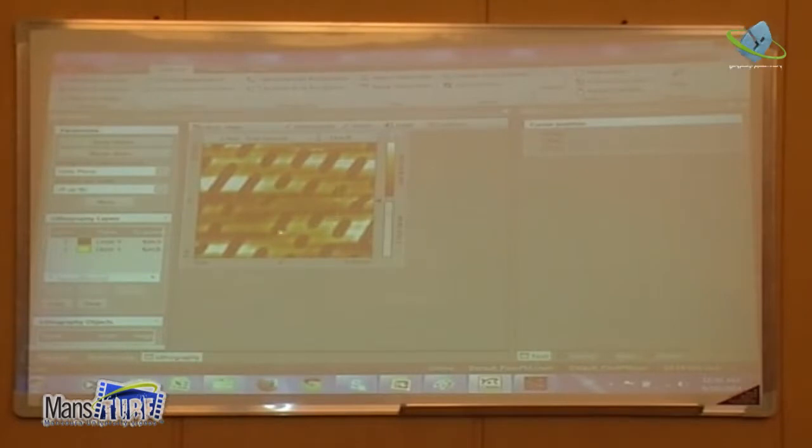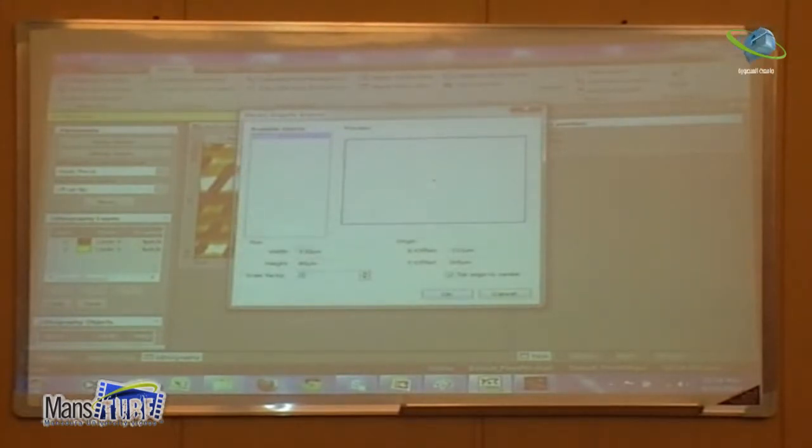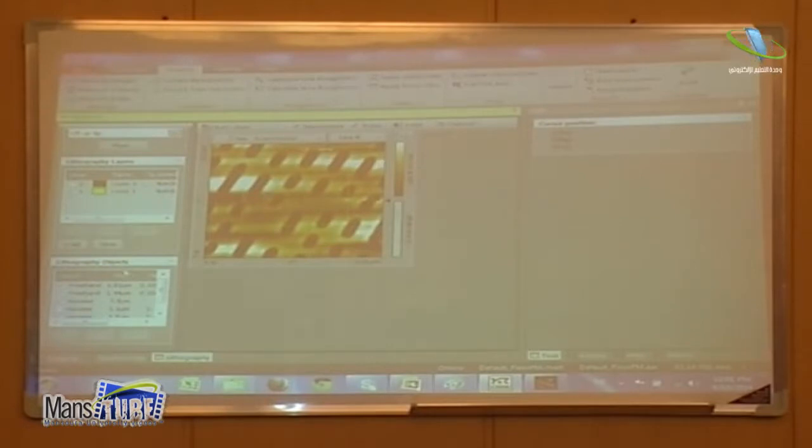Okay. The very beginning from the bottom. Okay. No. Wait a minute. So first here we have the size. We put 0.001. So we have it 1 micron. And then this is the origin of this image here. And the line is here. Yeah. Okay.